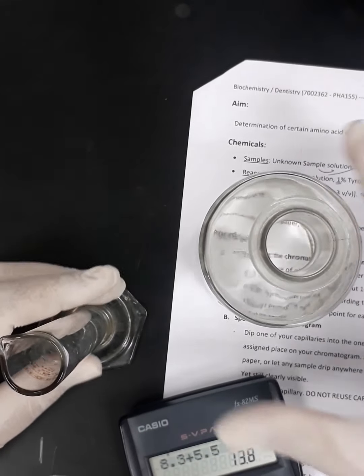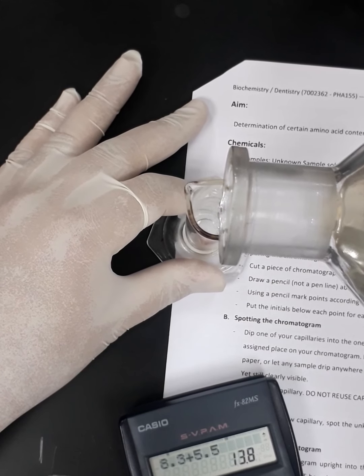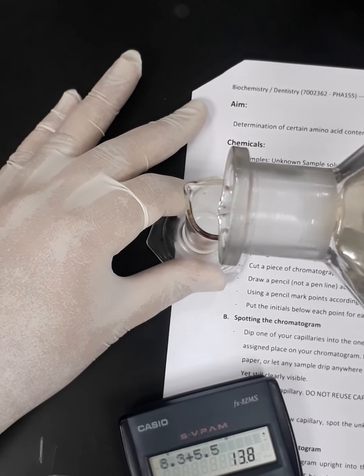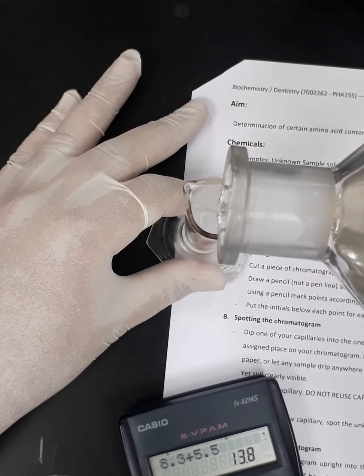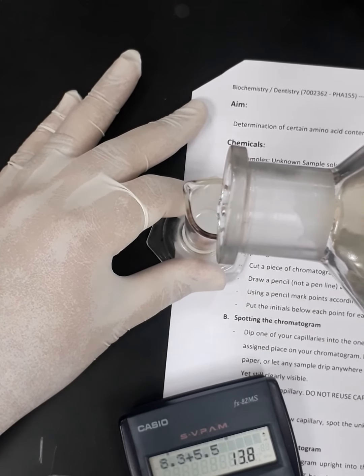So I will fill up with glacial acetic acid till the mark of 13.8. Okay.